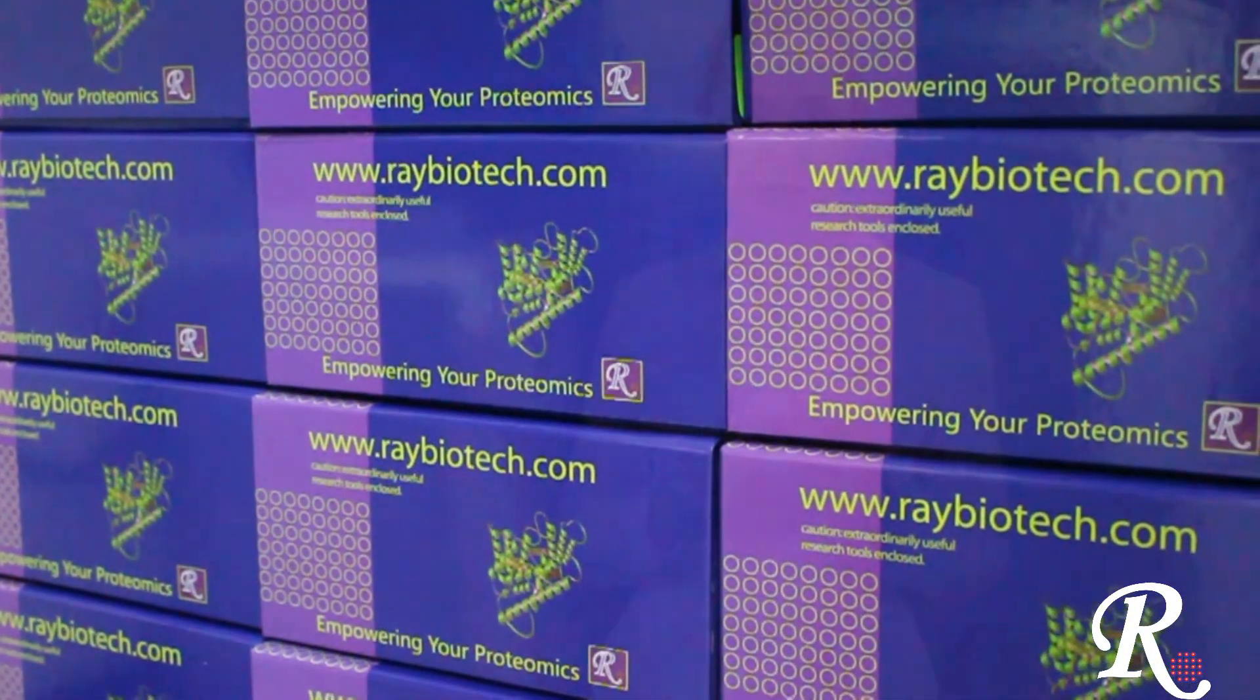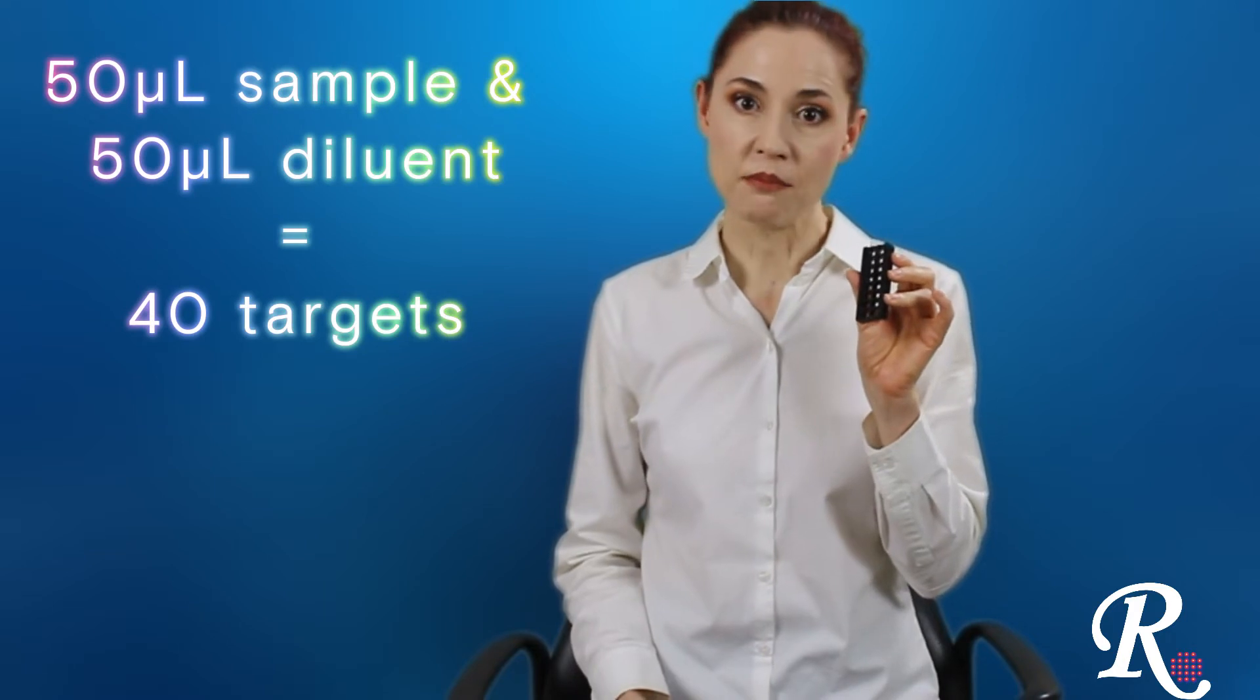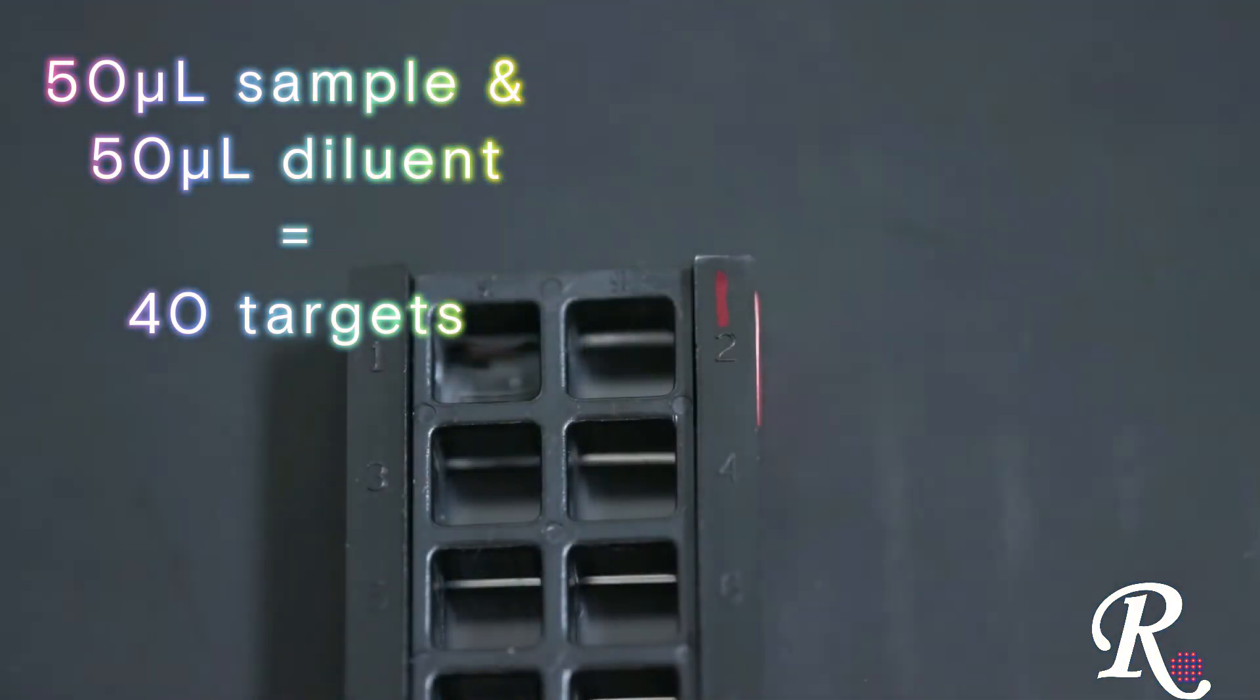So let me explain some logistics. On a single glass slide window, only 50 microliters of sample is needed for quantification of up to 40 proteins in quadruplicate, making this array 80 times more efficient and cost-effective than many singleplex platforms.